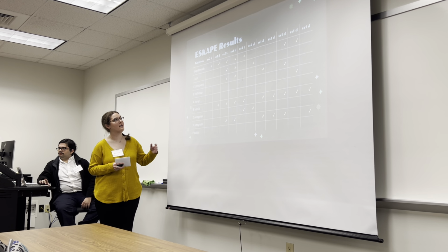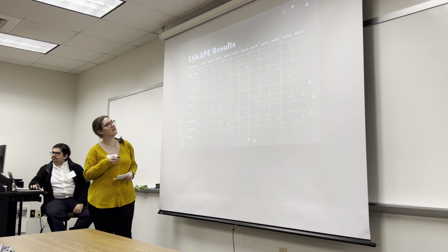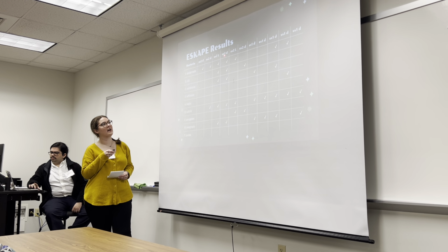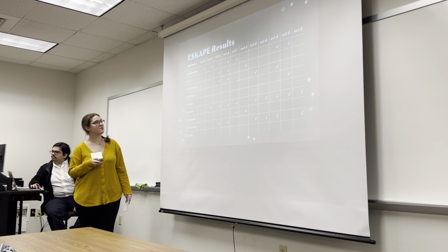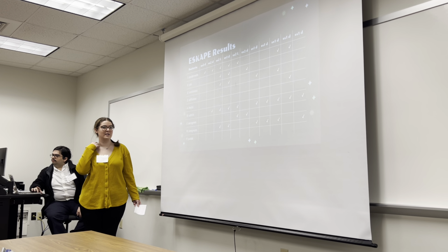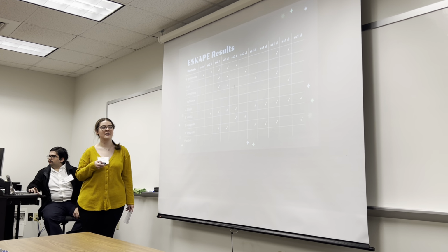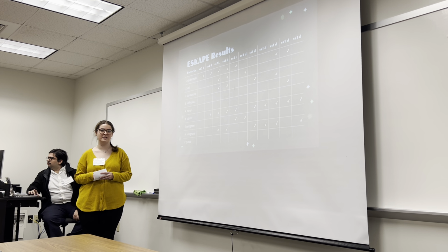So these were my results for the 9 bacteria. These are all of the bacteria tested, and at the top it has the soil sample number and then dark or light. So 1 is the Galveston sand, and 2 is the rosebush dirt. S. epidermidis and B. subtilis were the most common ones to have positive results against. However, there were 2 that did not have any results. That was A. baylyi and P. putida. The reason for that is because these plates were tested at 28 degrees Celsius.